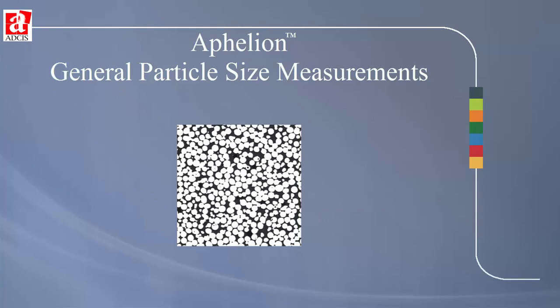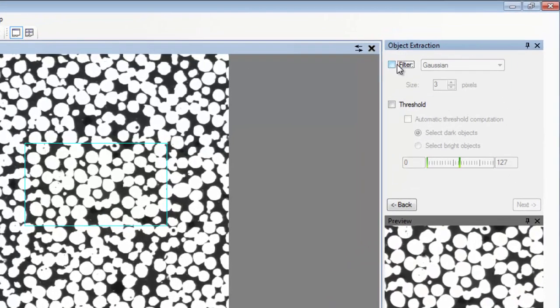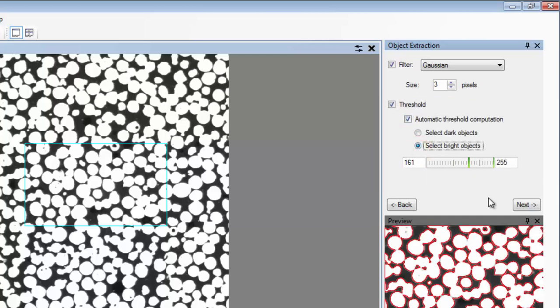As an example, with this image we can easily obtain the particle size distribution. We verify the calibration of the image, then select a Gaussian filter to reduce noise due to imaging.